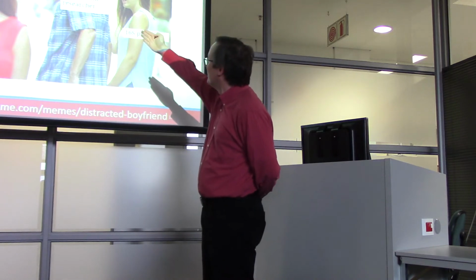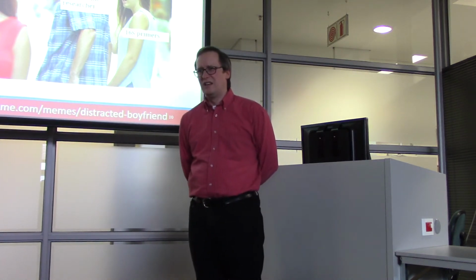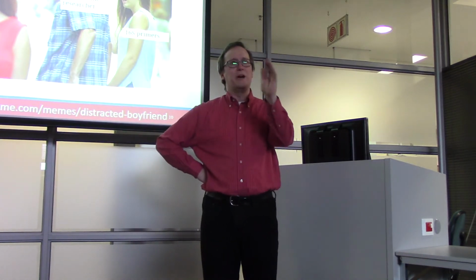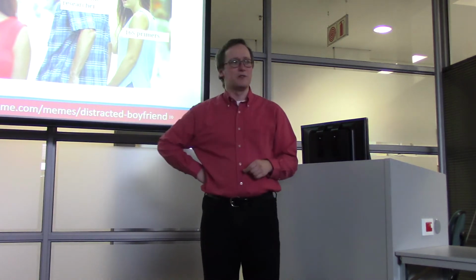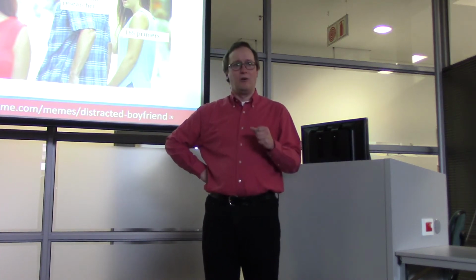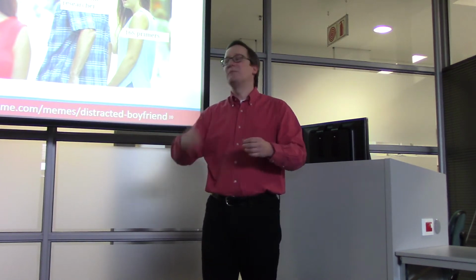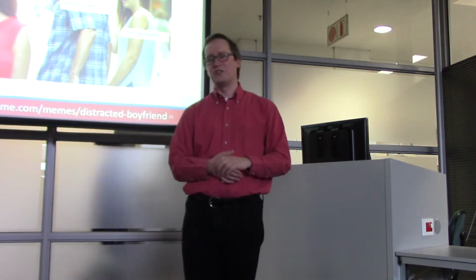So here we have the microbiome researcher. It's another white male. I'm sorry about that. This microbiome researcher has been working with 16S primers for a very long time, and they've worked really well for a long time. And now there's a new technology about. Must the microbiome researcher turn away from this tried and true 16S technique and switch to metagenomics?